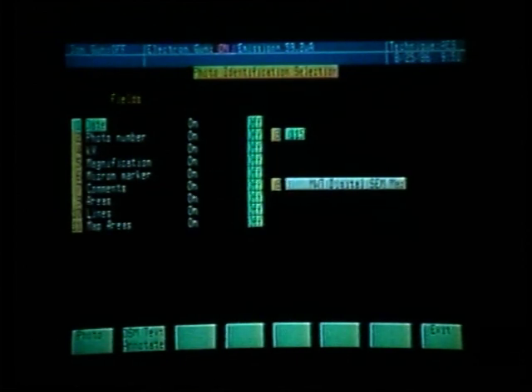We have now demonstrated various ways of displaying and massaging Auger line scans, including obtaining hard copies of those line scans, and also photos of the line scans superimposed either on SEM images or Auger maps. This concludes the section on Auger line scans.